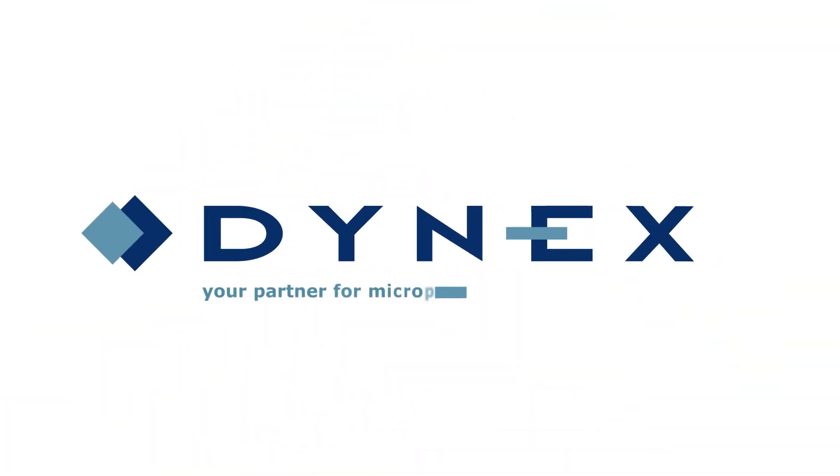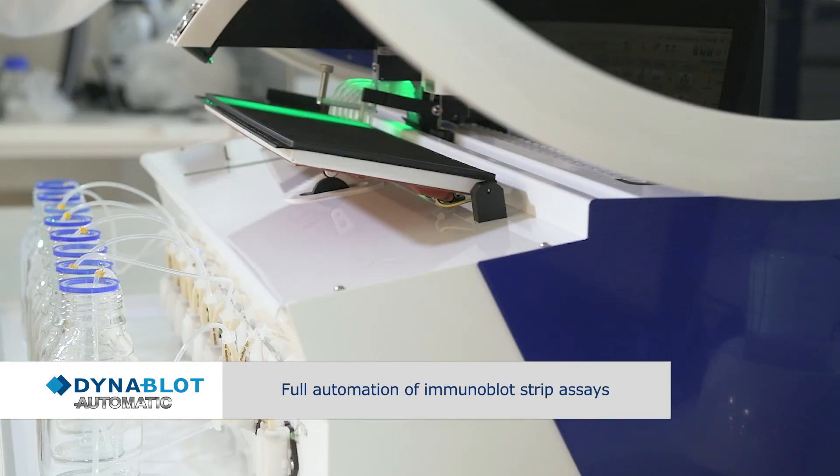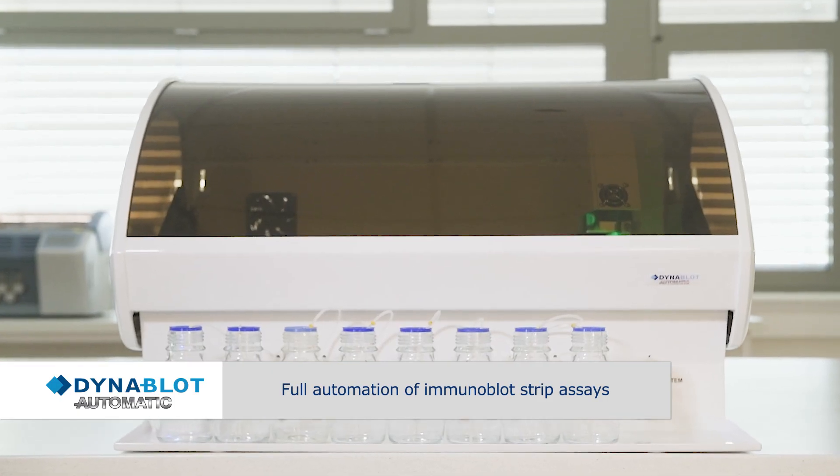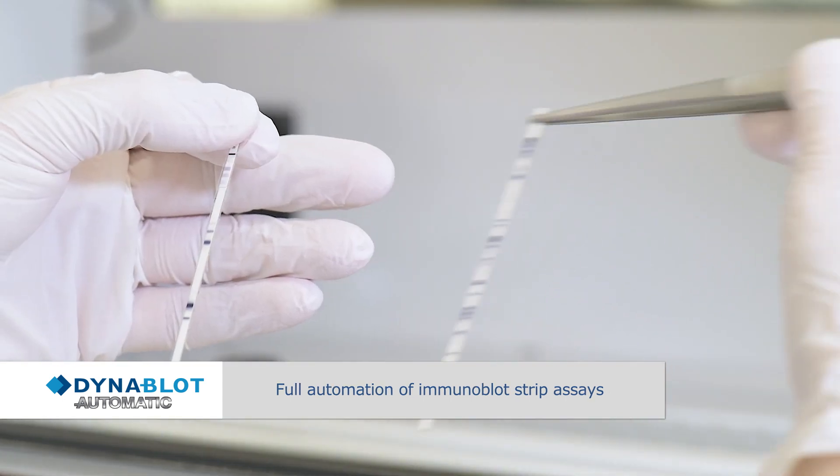Dynex, your partner for microplate and strip instruments. DynaBlot Automatic is a fully automated instrument for Immunoblot and Western blot assays in a strip format.